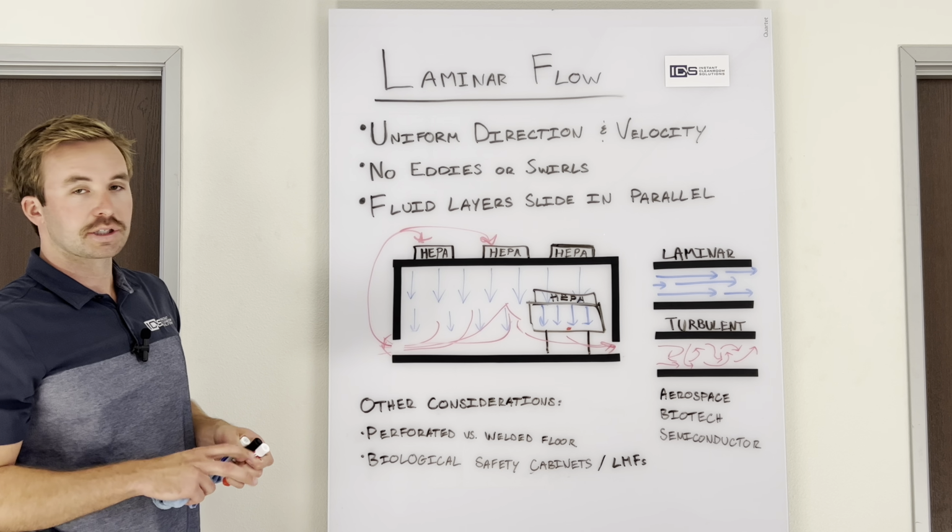Sometimes specifications won't necessarily call out whether or not you need vertical or horizontal laminar flow, but we can help advise you in the right direction if you're not quite sure. This is great for cleaning process piping, especially large process piping. So this was a 50 by 100 roughly ISO 5 clean room, and they needed to clean beam array tubes that were about 40 or 50 feet long, a couple tons. And so we had to clean these to a level that had never been achieved before.